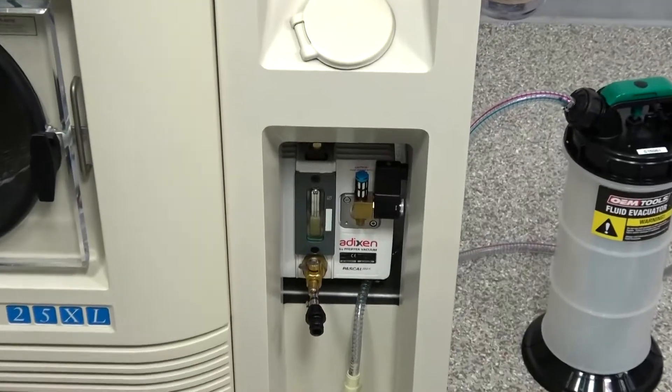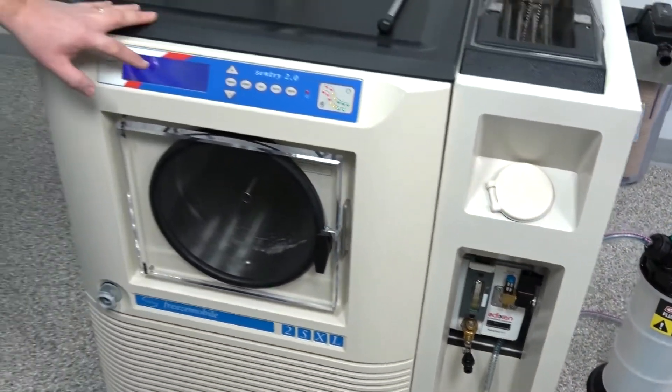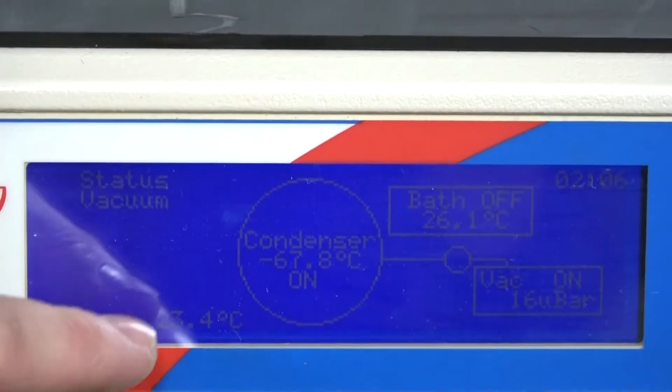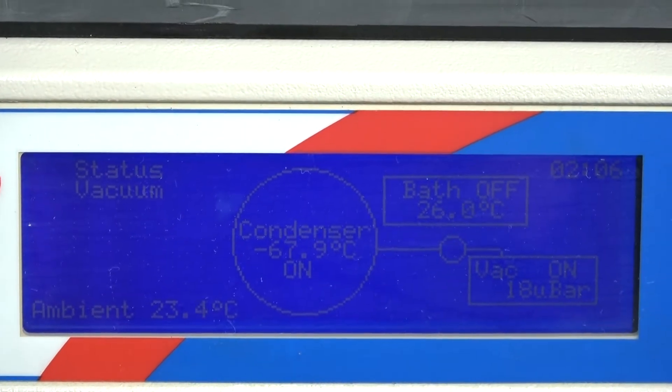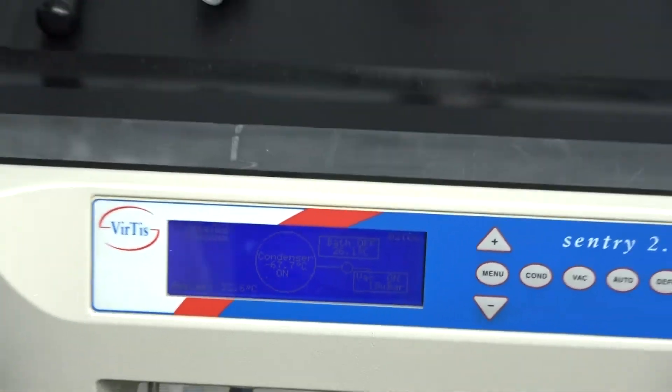It's a great running machine, running at factory specs. You can see right now it's cooling at about negative 67 degrees. If we had the right ambient temperature, we'd be able to achieve negative 70, which is the factory spec — just an awesome running machine.